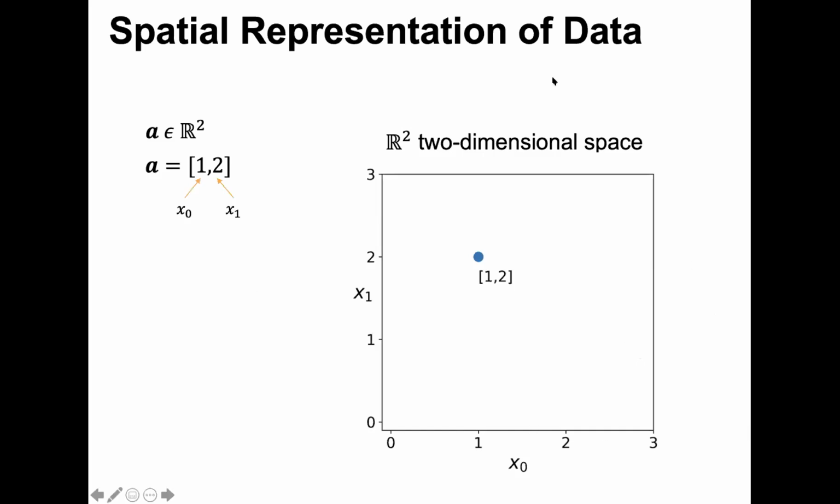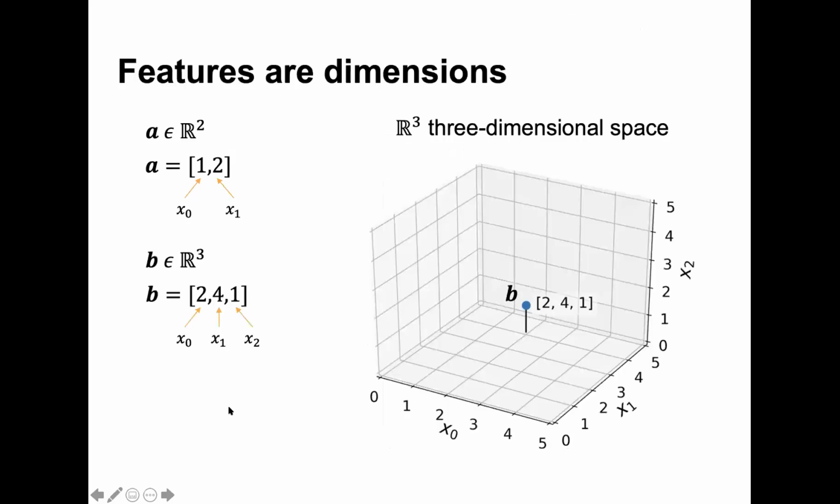The order that you put these axes in doesn't turn out to be very important for some of the things we're doing, but one of your axes will always control the first column and the other axis will always control the second column. Of course, if you have 3-dimensional data, you'll go into the z-axis: x, y, z. Pretty soon you'll see that it's hard to think about more dimensions than 3 because you can't visualize it. This leads to the idea of reducing the dimensionality down to 2 or maybe 3 dimensions so that you can visualize the data. We'll be talking about that a little bit, or a lot, tomorrow.